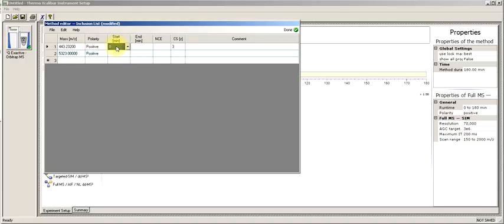to elute between 24.5 and 25.5 minutes. Then the rest of the time, your general method will work as it normally would. But for this minute, you won't fragment anything else except for what is on your inclusion list.